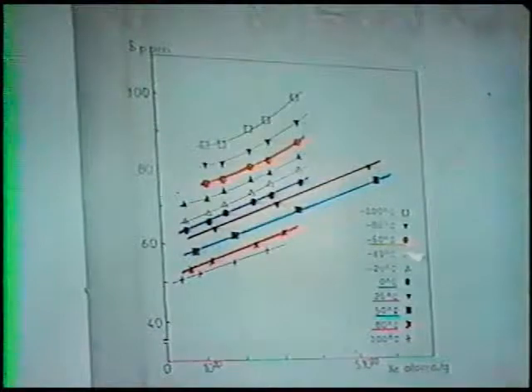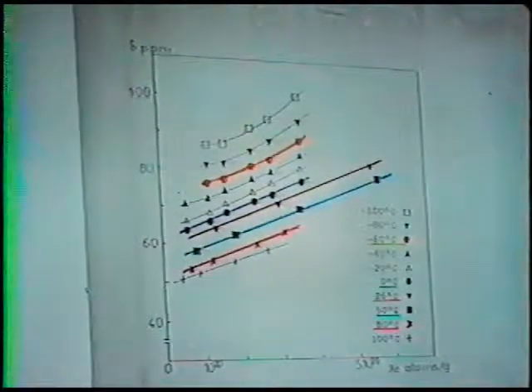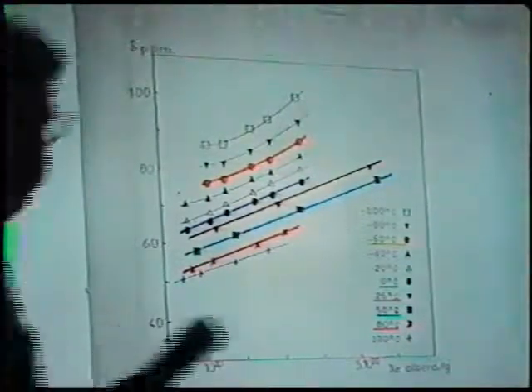At about minus 40 or minus 60 C degrees, we start to have such a curvature, which is characteristic of a stronger interaction between the cation and xenon atom. But we see that when we increase the experiment temperature, we arrive at a limit of the chemical shift, which is really the real chemical shift when the residence time of xenon on the surface is completely negligible.